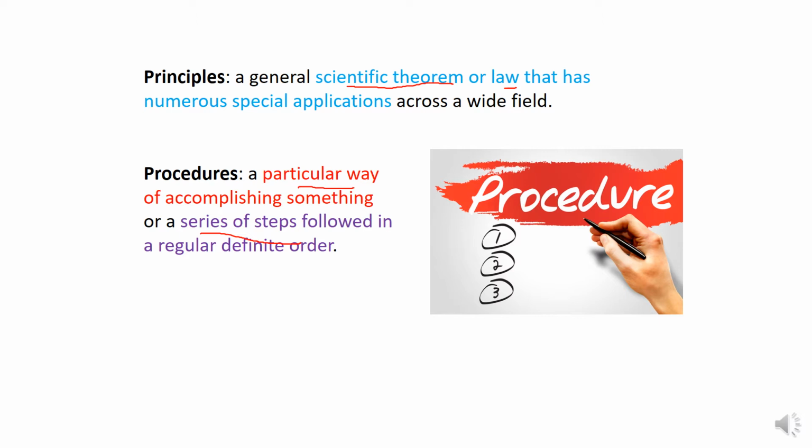If there is one procedure, for example, you can do DNA extraction, then you can do quantification of DNA, and number 3 is you will do a polymerase chain reaction to detect, for example, COVID-19, right? So you have to follow these steps. You cannot jump from 1 to 3 or from 1 to 5. These are a series of steps in consecutive order. So we sometimes call them procedures or protocols to do some work in the lab.